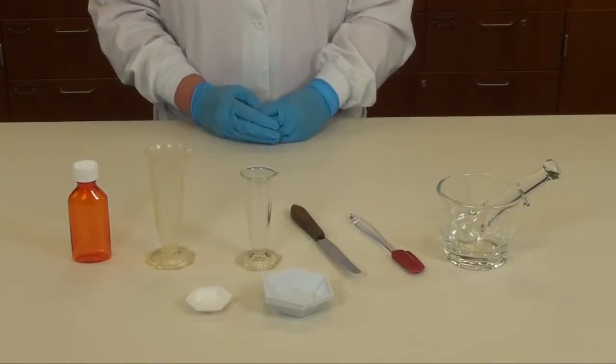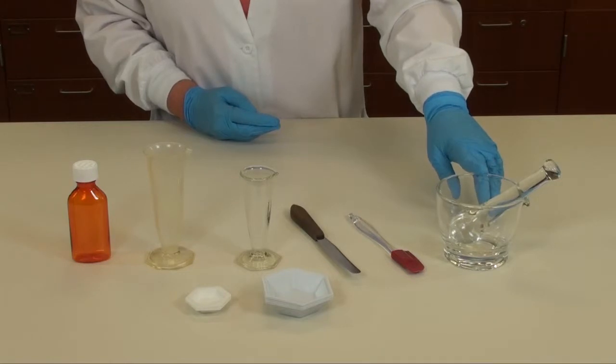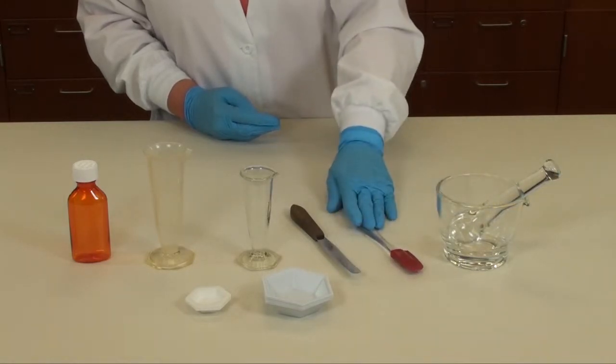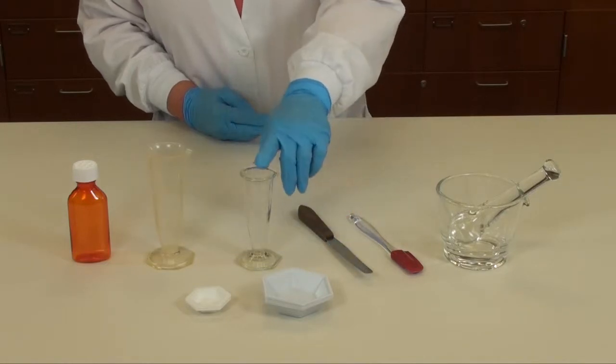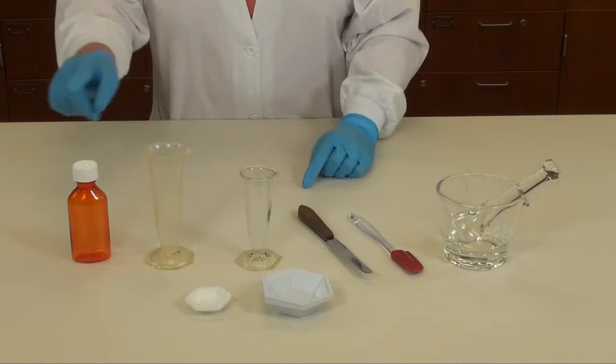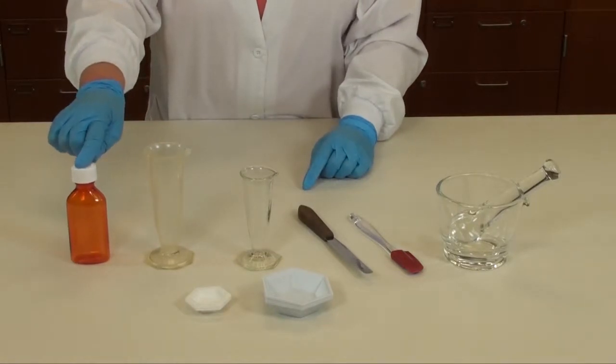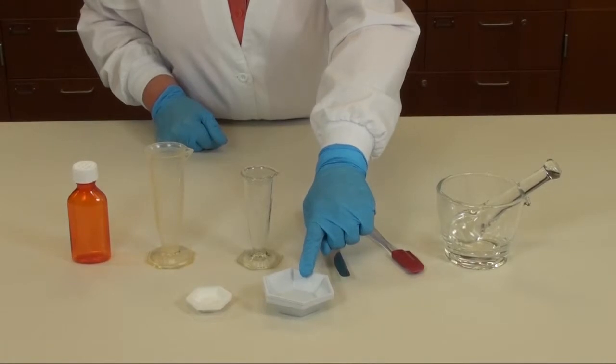The required equipment for suspensions will be a glass mortar and pestle, a rubber spatula, a small metal spatula, a two or four ounce graduated conical, a three ounce oval prescription bottle, and weigh boats, both medium and small.